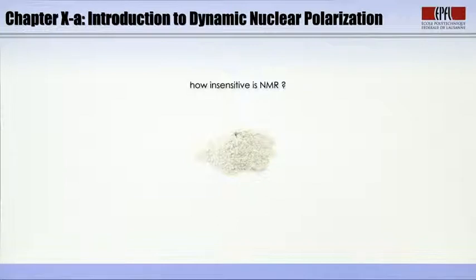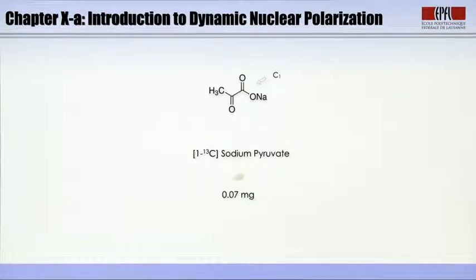So the first question that is important to ask in this MOOC is, how insensitive is NMR? You probably know that if you have, let's say, milligrams of sample, sensitivity is usually not a problem, but if you decrease the amount of sample to, say, for example, 70 microgram, you might run into trouble.